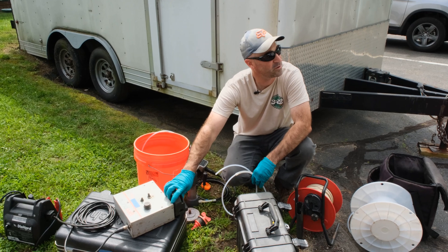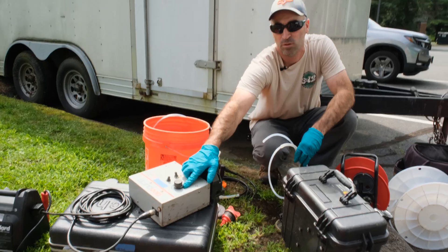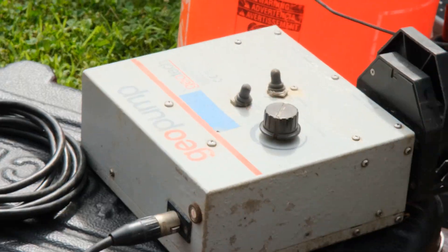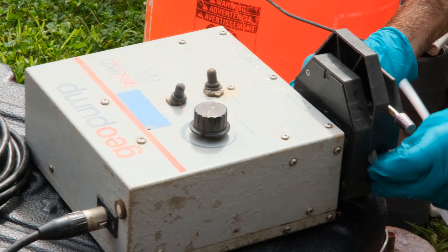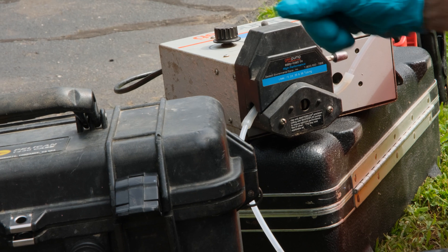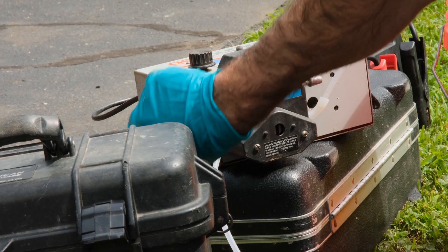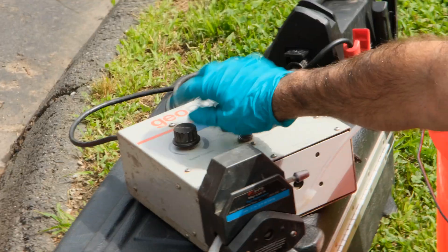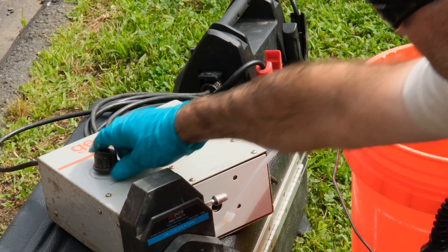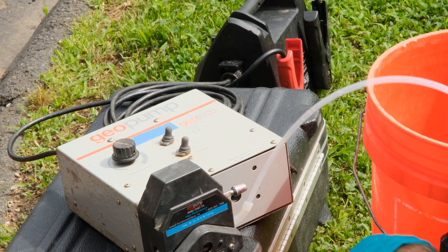This is the older style peristaltic pump — it's easier to use and has an on/off switch, forward and reverse, and a speed control. It's essentially the same process: open the jaws, set the tubing in, close it, set your direction — forward is clockwise, reverse is counterclockwise. Since we're coming up through this side of the head going to the right, it is in the forward direction. Turn your pump on until it rotates, then back it down to a slower flow rate that the well can handle.